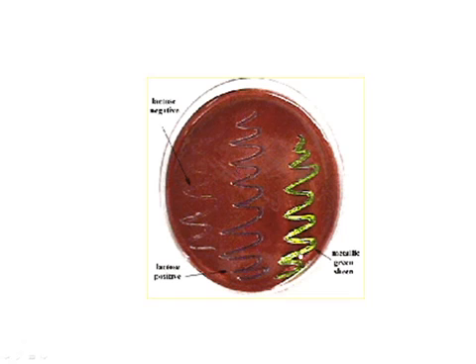Our third streak is obviously growing, so it's a gram-negative as well. This metallic green color is characteristic of a specific gram-negative bacteria called E. coli. Anytime you see this metallic green color, it automatically indicates that E. coli is present.